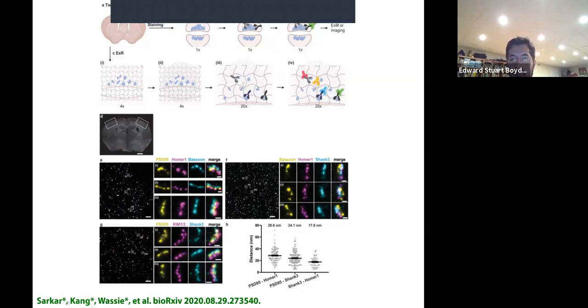Why is that important? Well, if you bring in antibodies to label proteins, the antibodies are big. There are some proteins that are too crowded to label. In the upper right, for example, you see two antibodies, one green and one red, that are labeling two proteins. But if we separate proteins from each other, we make more room for antibodies to access the internal proteins. Now you can see the red and green antibodies labeling their targets, but a blue and a yellow one also.